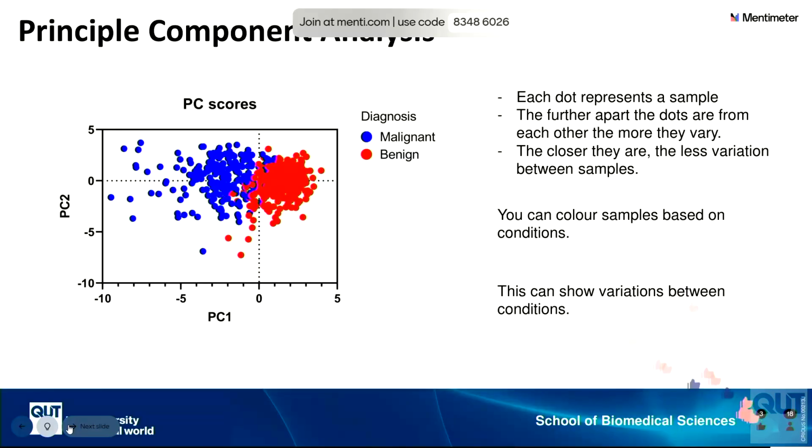Don't worry about the math. Learn about how you can use a PCA plot to your advantage. You'll never have to calculate one yourself. There's plenty of tools online to do it for you.